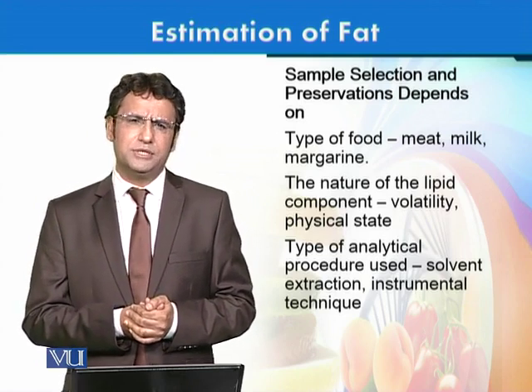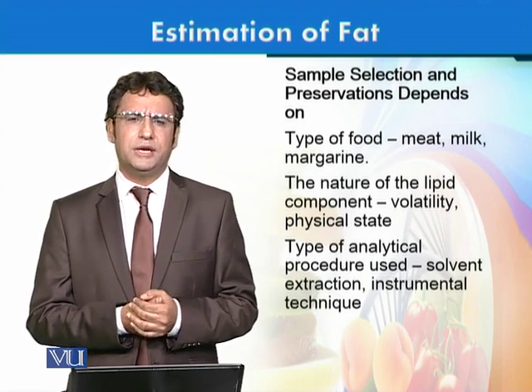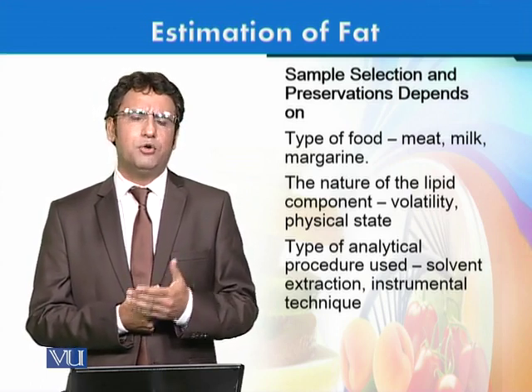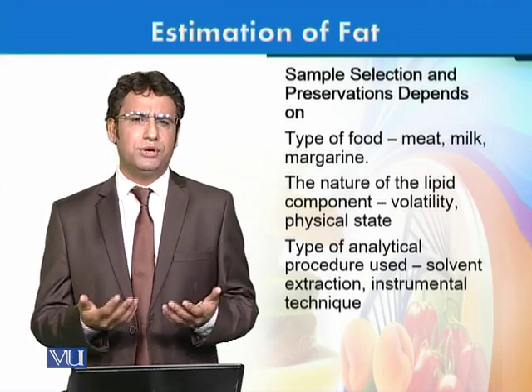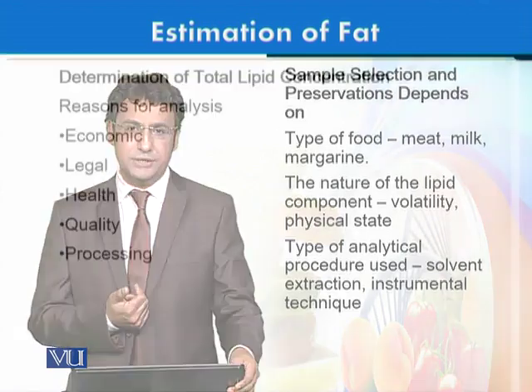Type of analytical procedures: there might be different analytical procedures. So we need to look at what kind of analytical procedure we are following, and that would dictate what kind of sample or how much of the sample you are taking. Or if you are not performing this analysis immediately, then how are you going to preserve that fat sample before it is actually analyzed in the lab?